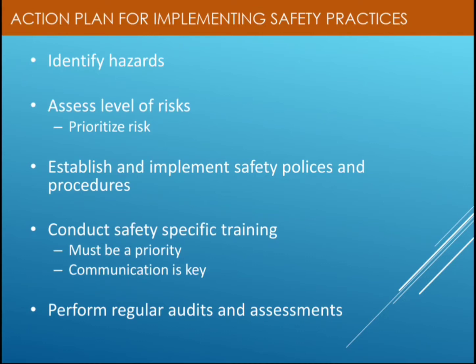So we have to establish and implement the safety policies and procedures. We have to conduct safety specific trainings, and that should be the priority. It must be a priority. Why is the word must used? Because must means it is mandatory, it is obligatory, and that's why we have to compulsorily conduct the safety specific trainings for the personnel. Then we have to perform the regular audits and assessments.